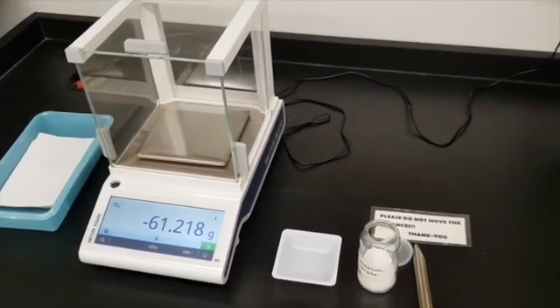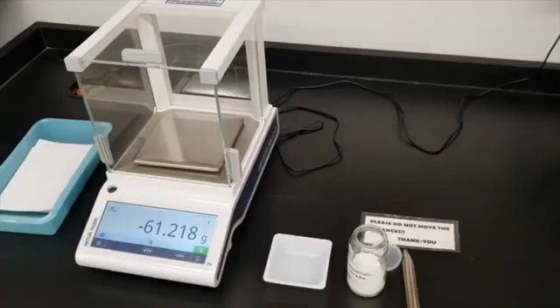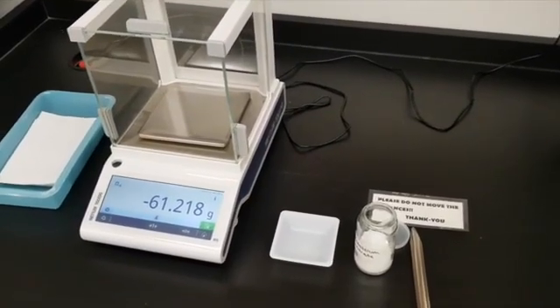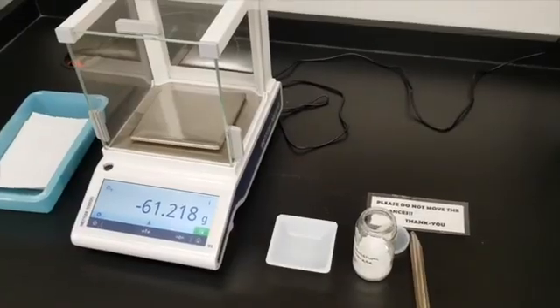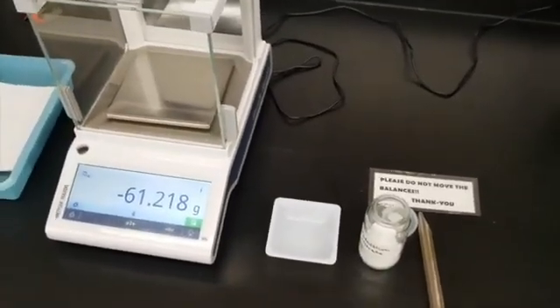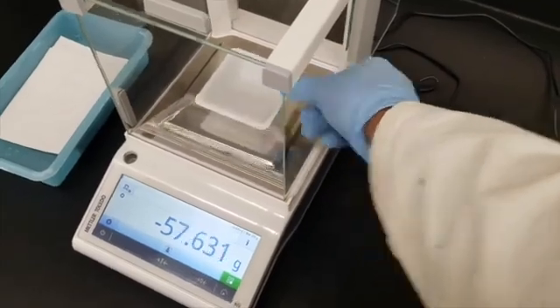Let's start off by getting our mass of potassium nitrate for our trial. Your directions say to get the mass of your container as well as the mass of the container plus potassium nitrate, and then subtract the difference. We're going to simplify things a little bit since we're the only ones using this mass balance. I'm just going to go ahead and tare our container.